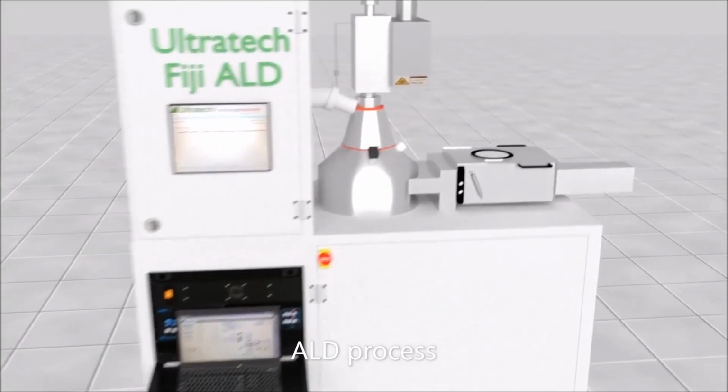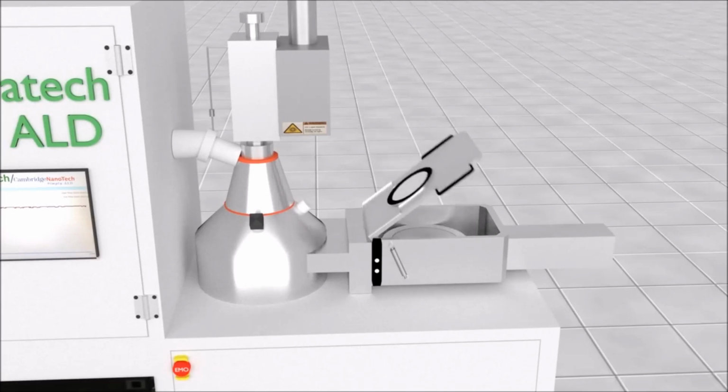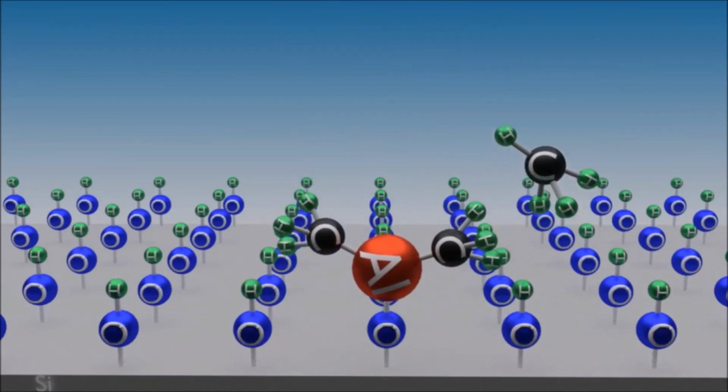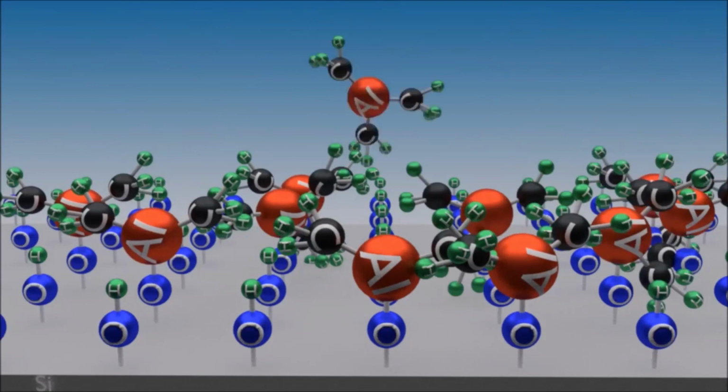Atomic layer deposition, or ALD, is a process which can grow high-quality thin films using a binary sequence of half reactions, each depositing an alternate material at low pressure. ALD has the unique property of having self-limiting reactions, which allows for precise growth control over complex structures.